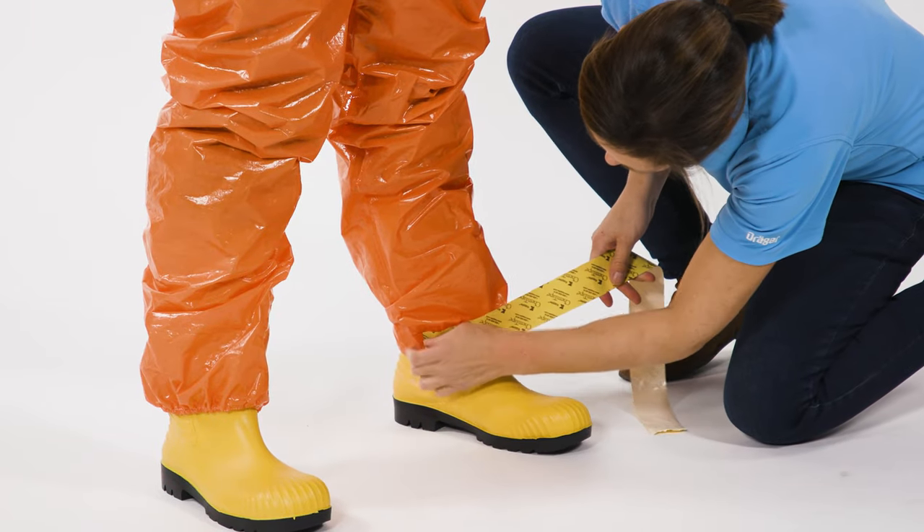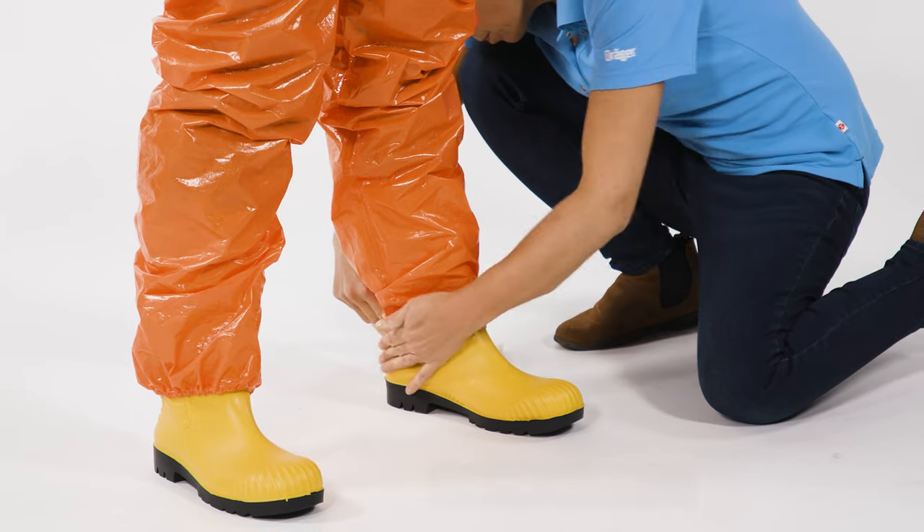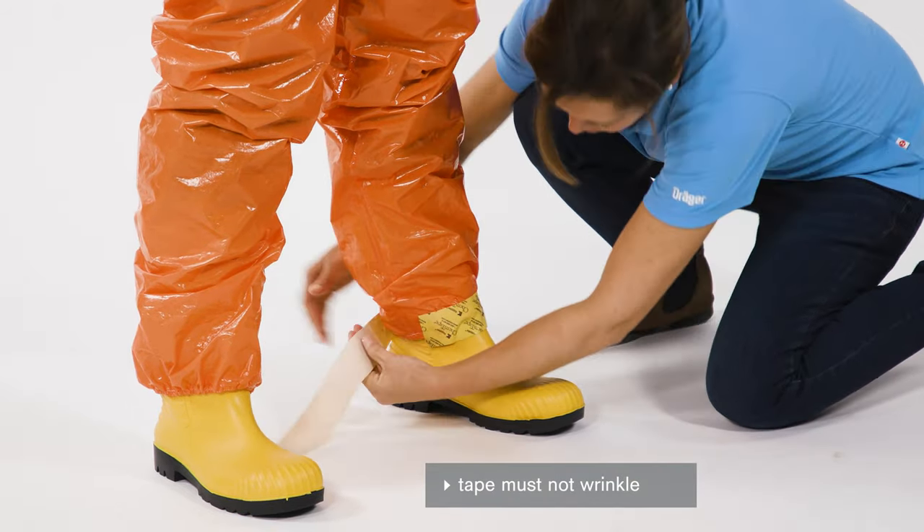Also have the boots fixed to the leg ends of the suit with a chemical-resistant adhesive tape. Here too, there must be no wrinkles on the tape.